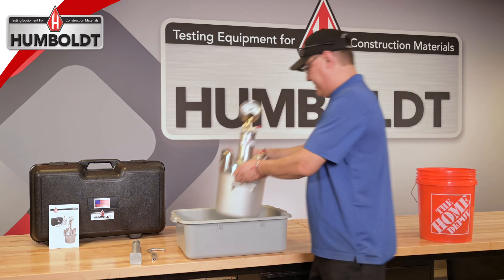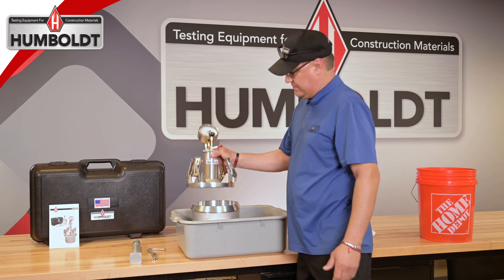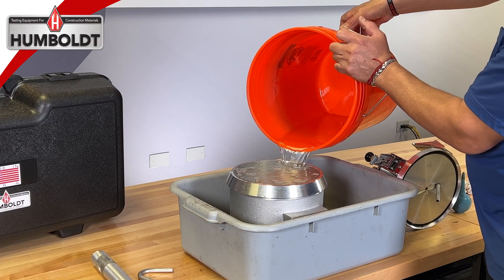To begin the air meter calibration, first set the air meter into a large pan to prevent spilling excess water. Remove the lid from the air meter and fill the base with room temperature water until it overflows.